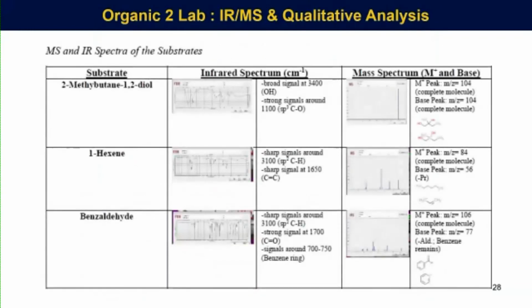So they were able to collect those pieces of information and then fill this in. So this was something they had to come up with. We led them to do tables, and they were able to put tables together quite nicely, where all of this now is looking at spectra. And we test them on that in the lecture part of the course. So this helps with that.